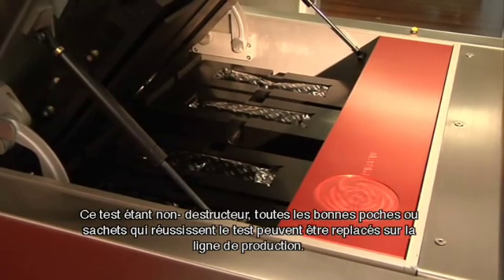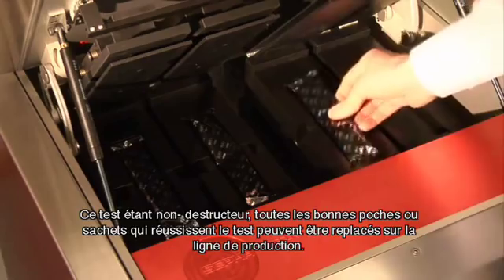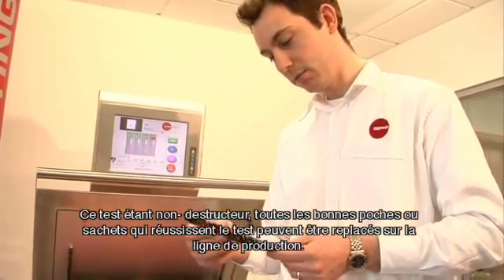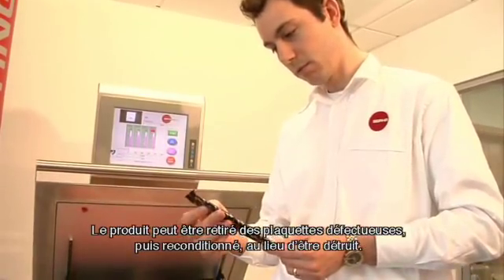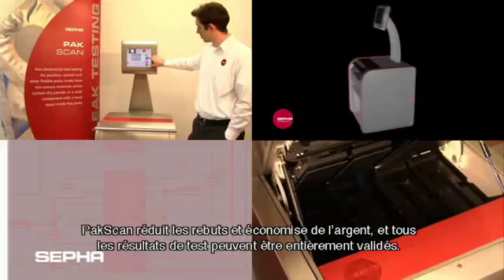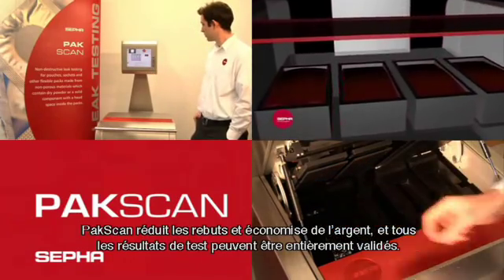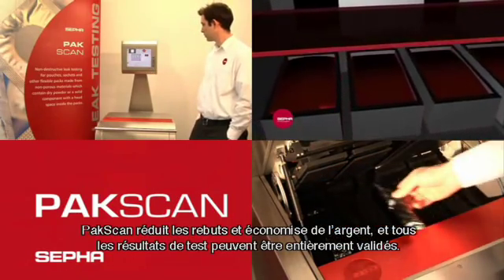As it's a non-destructive test, any good pouches or sachets that pass the test can be returned to the production line. Product can be recovered from any faulty packs and repacked rather than being destroyed. PackScan reduces waste and saves money, and all the test results can be fully validated.